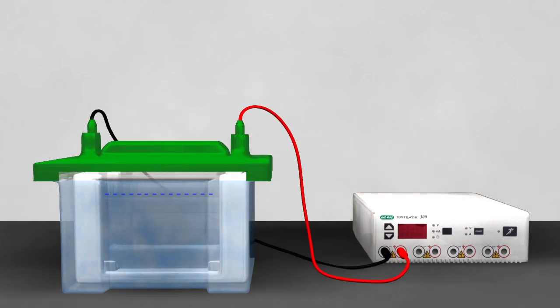The goal of polyacrylamide gel electrophoresis, or PAGE, is to separate proteins within a protein lysate according to size, shape, and or charge.